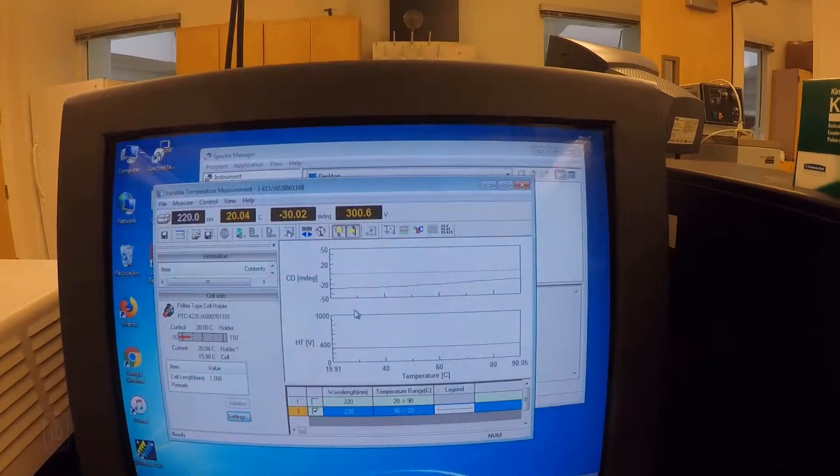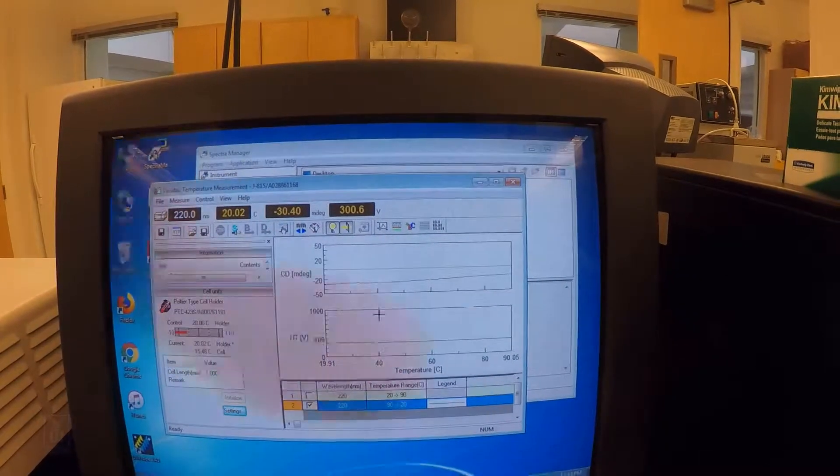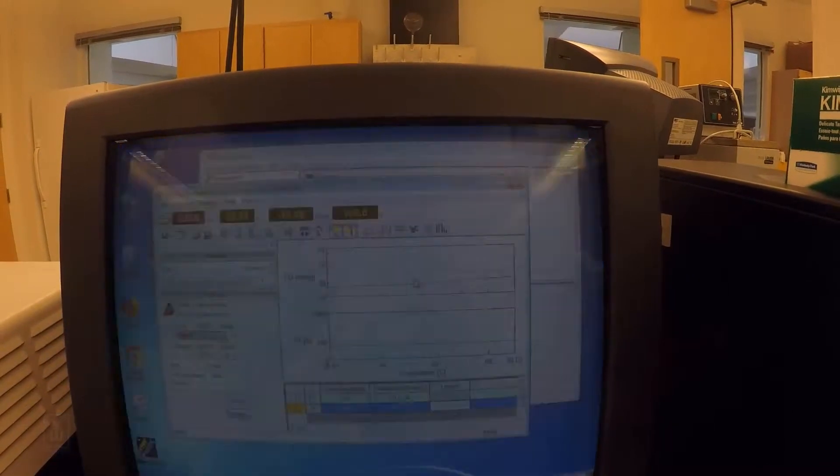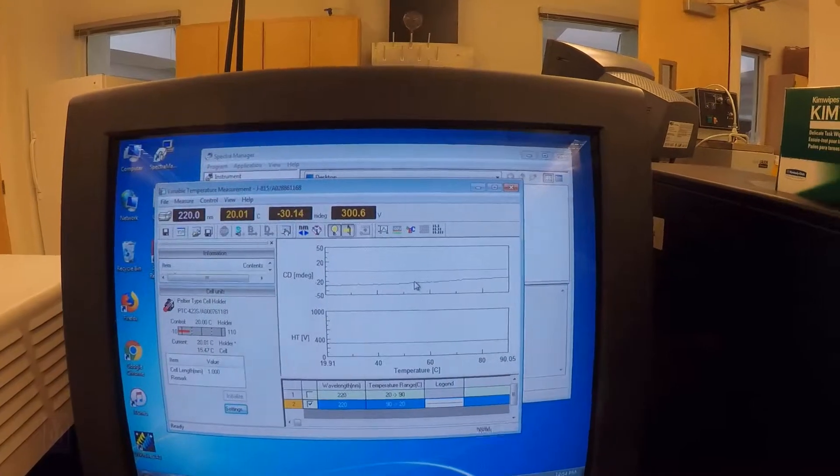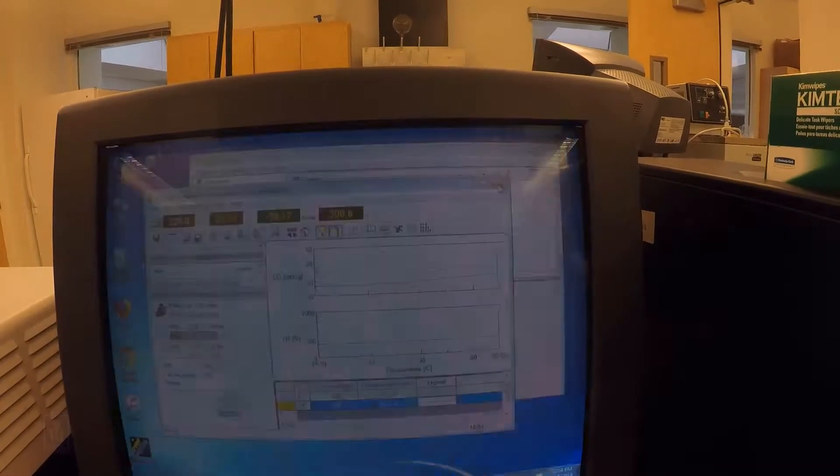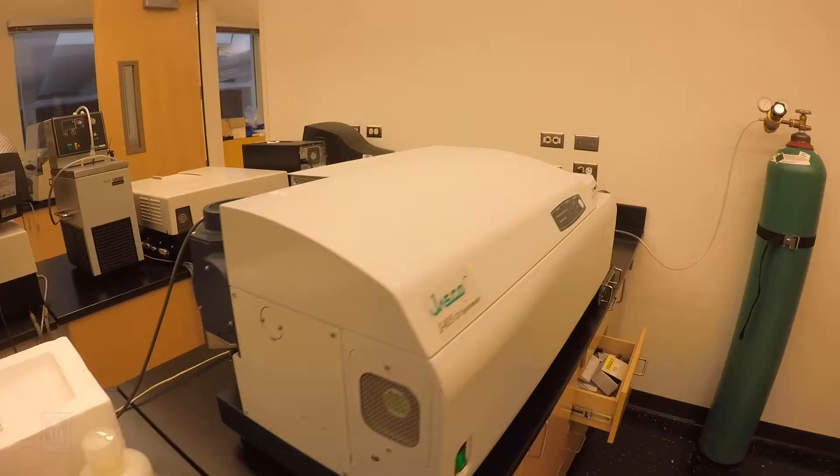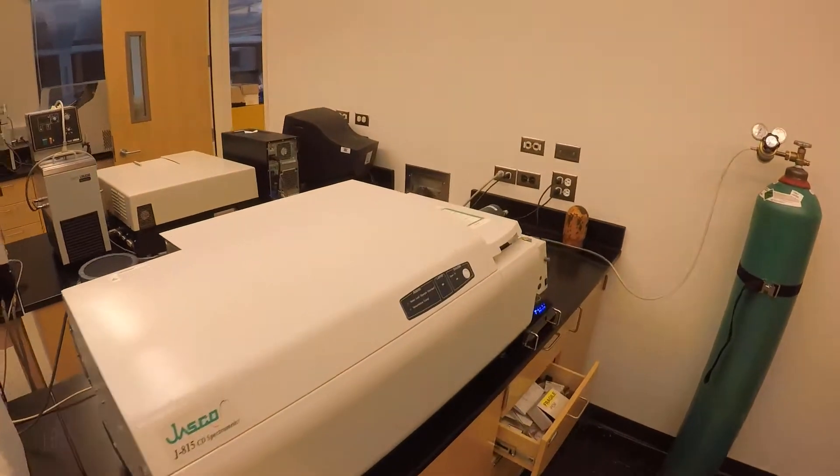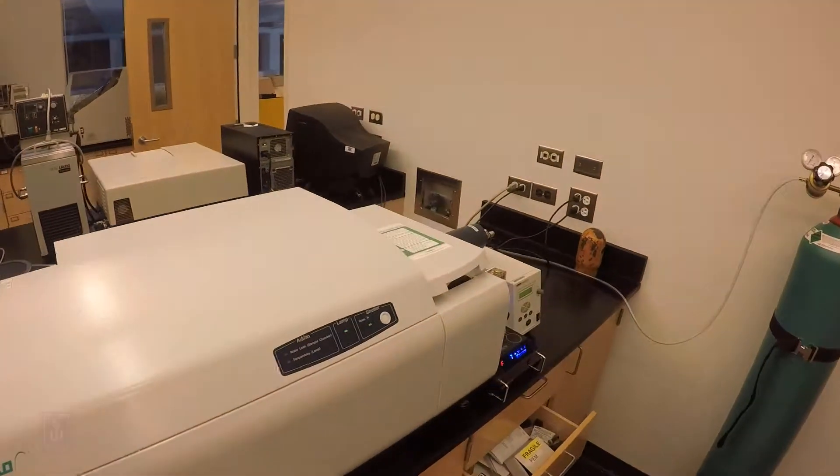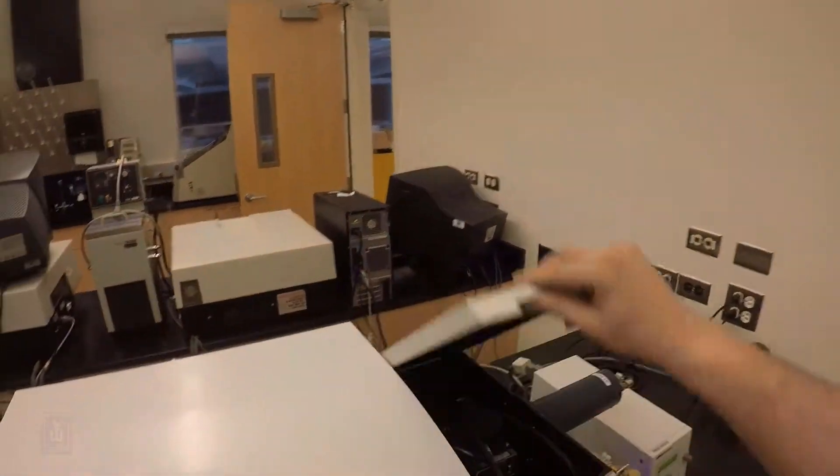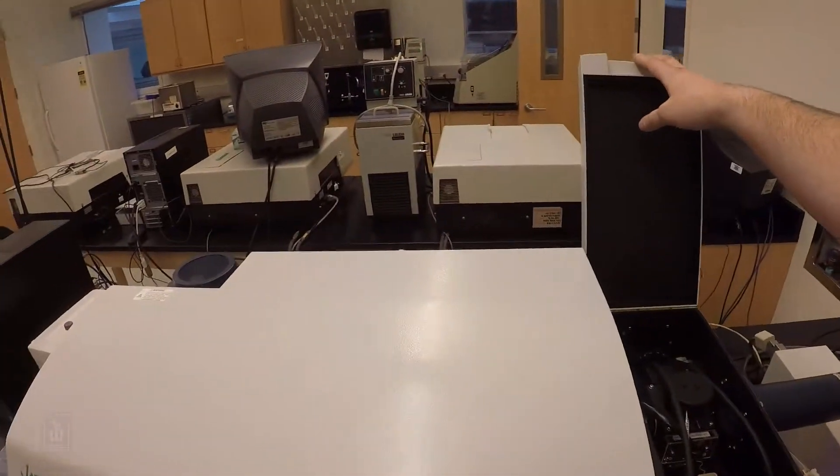But at this point, we got our melting point, we got our spectrum, we know how much helix we got. That's about all we can get out of it for now. There's a lot more that this instrument can do. But for now, I'm just going to go ahead and shut it down, take my sample out, clean out that compartment.